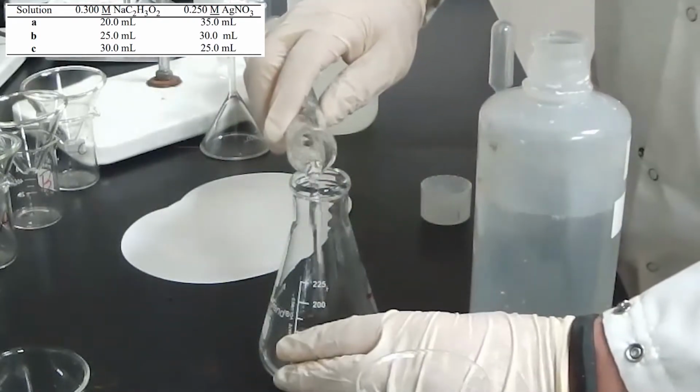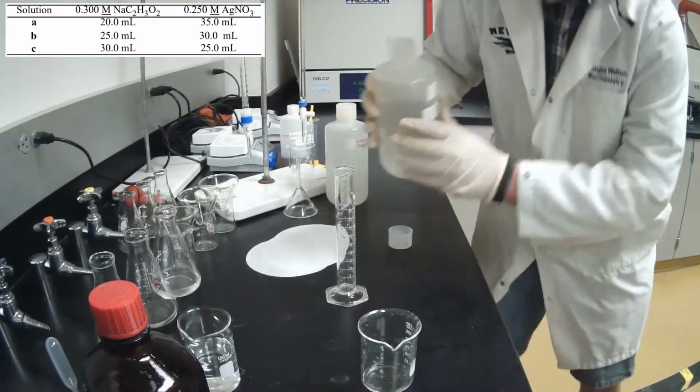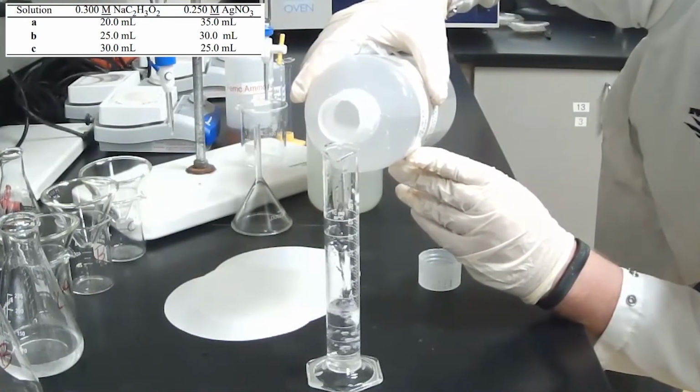As soon as we add these together, they're probably going to start reacting because they did in the waste container. We'll get to that in just a second. 25 into this one, to beaker B. And I'm not doing these in order. That will drive some of you nuts.